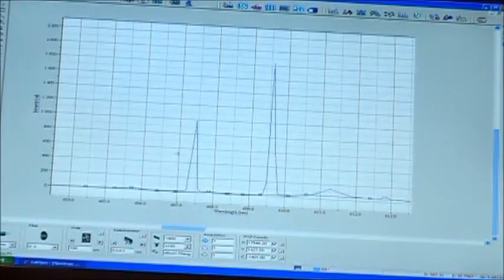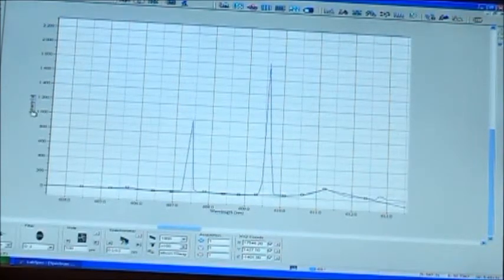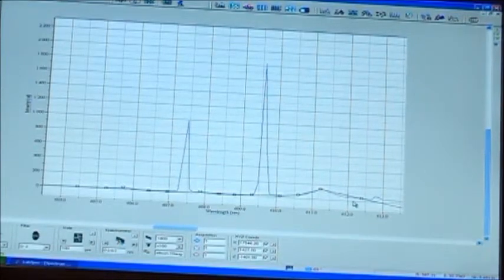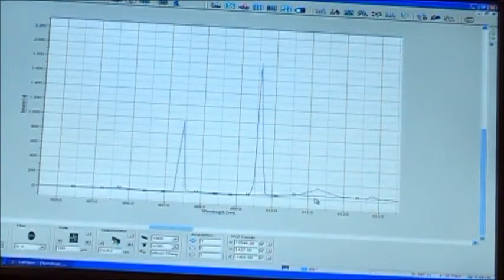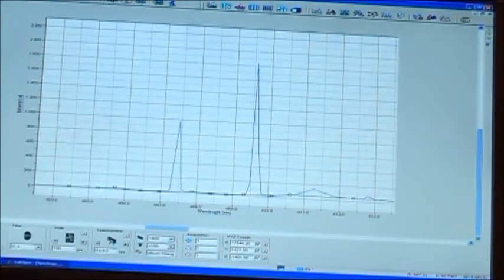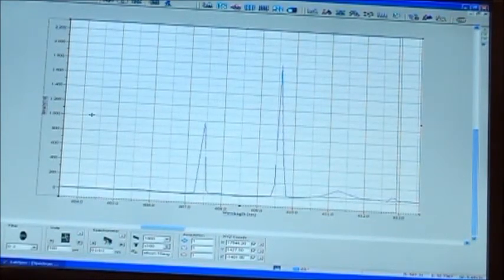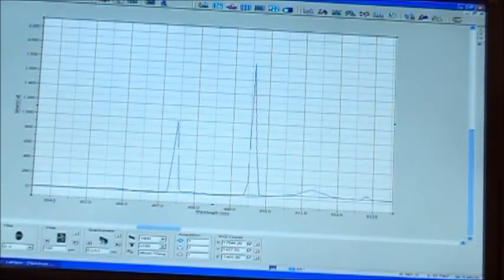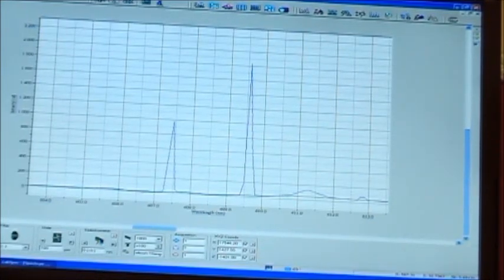If you realize you've made a mistake and have accidentally placed a baseline point on one of your peaks, the next icon down is a baseline point removal tool. So you can go back over the point again, click on it, and it will remove that point from your baseline calculation. And then the final icon on the left side is just an axis shift. It just slides your scale left and right. Not the scale, but the whole image. There's really no reason to click on it. And that's going to conclude the icons going down the left side of the screen.